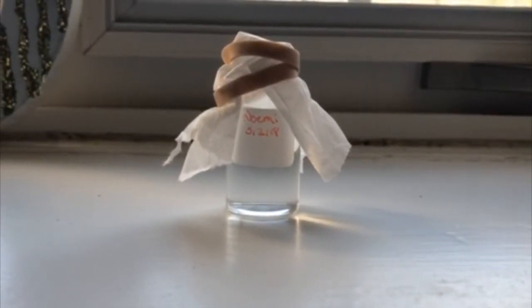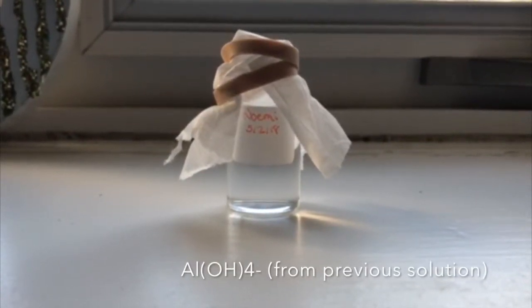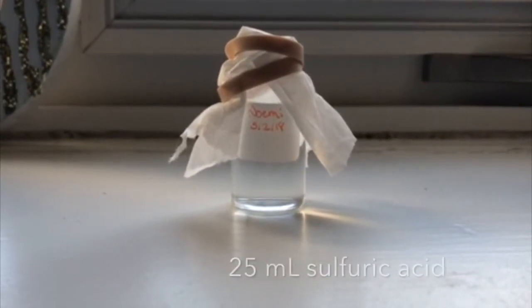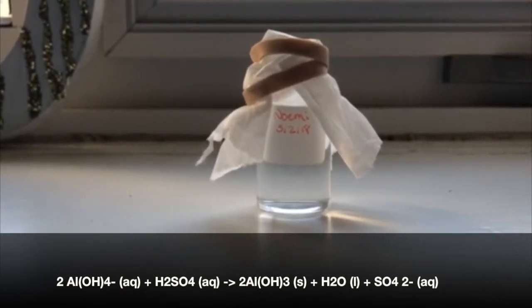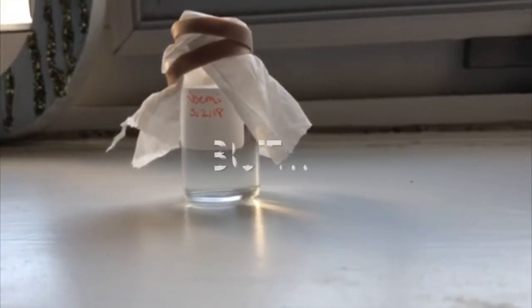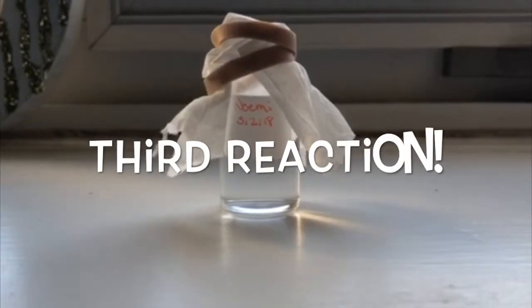Finally, after we did that, for the second reaction, we then took the filtered Al(OH)4- solution from reaction 1 and slowly added 25 ml of sulfuric acid. This then caused the following reaction to occur. The addition of the sulfuric acid initially caused a white precipitate to form since the aqueous solution Al(OH)4- converted into a solid Al(OH)3. However, we saw that as we added more sulfuric acid, a third reaction began.